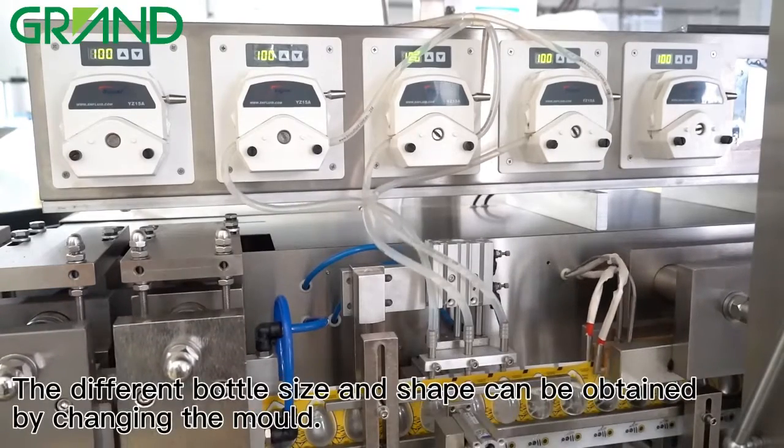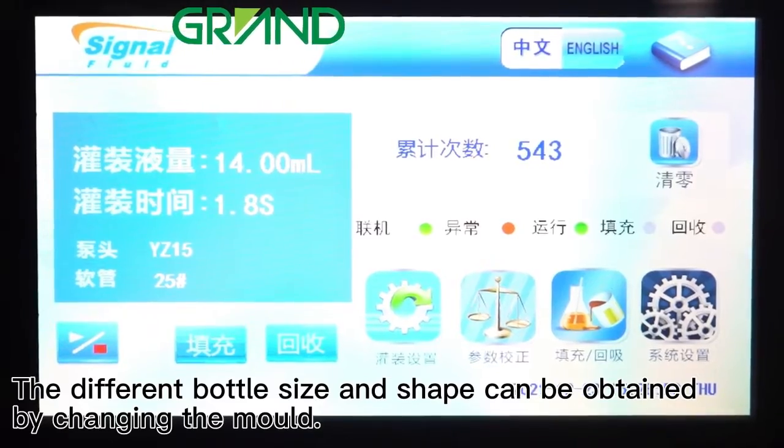A different bottle size and shape can be obtained by changing the mold.